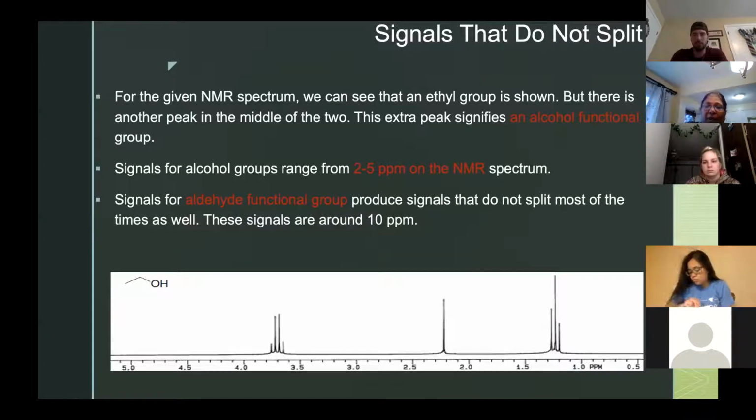And he will always appear as a singlet because he is not going to be affected by his neighbors. So in a way, it'll be easier to identify him because he's a singlet, or sometimes you'll have to identify him at the end, okay? Either way, he's very unique.